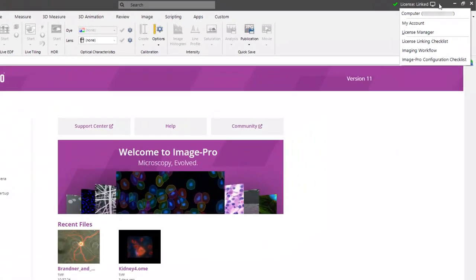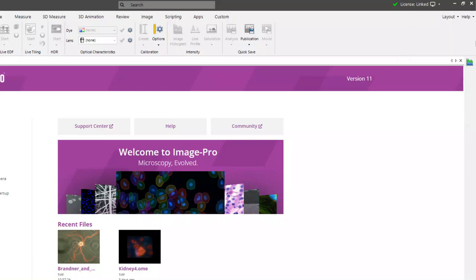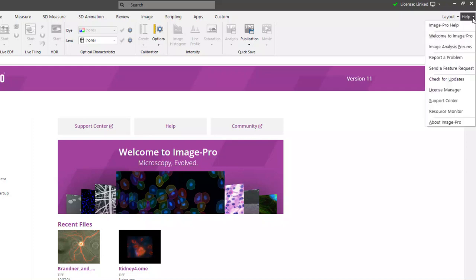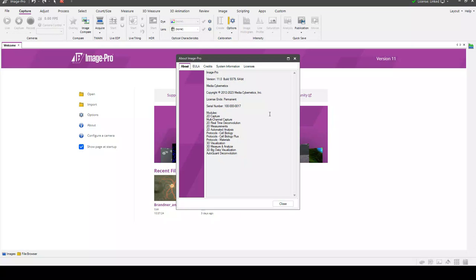You can check the License menu on the right, where we can see that the license bundle is linked to the computer. We can also open the About ImagePro dialog and check the About and Licenses tabs to see which modules and module extensions are included in our license bundle.